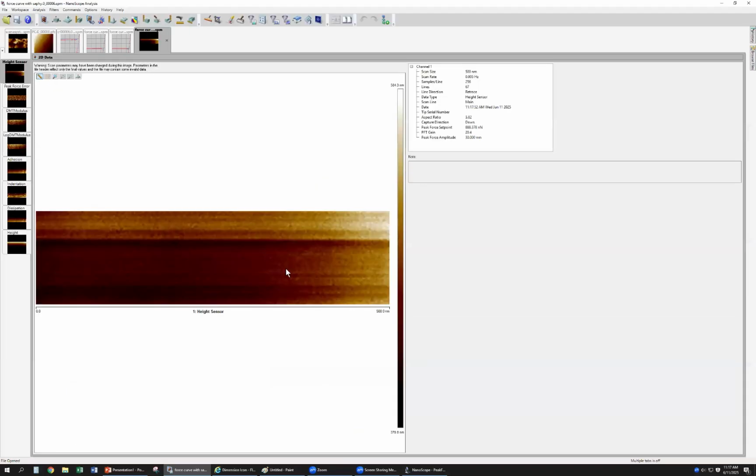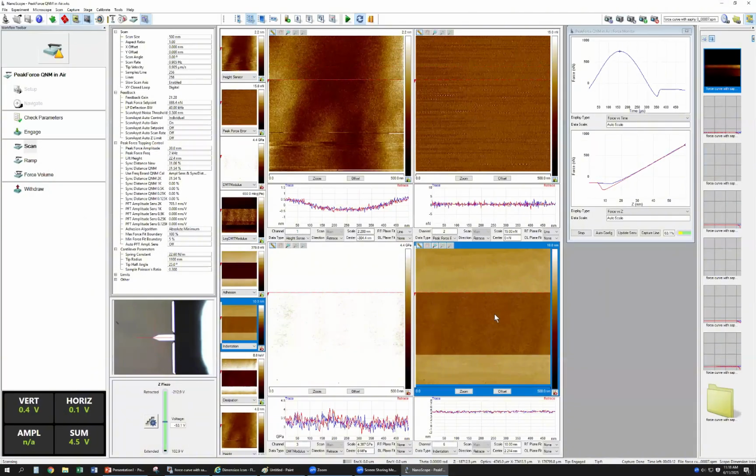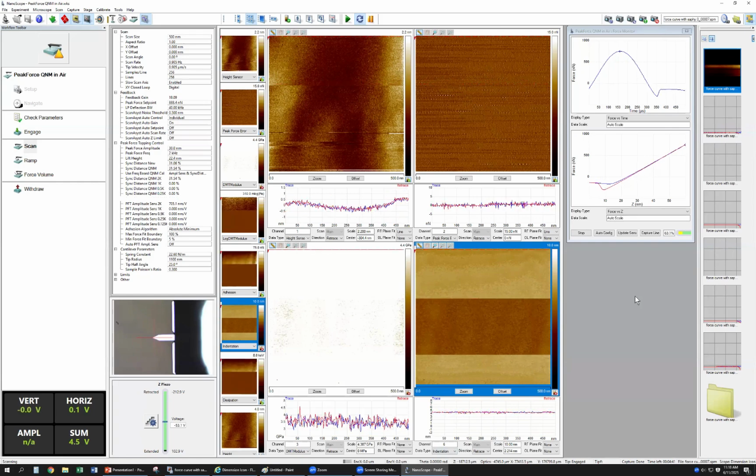After capture, then open this image. Open this image to take this the indentation one. Okay, indentation. That means all the force is changed. That means it's not kept everywhere here, right? A little bit changed, but we can get the average data. Okay, let me scan from top.